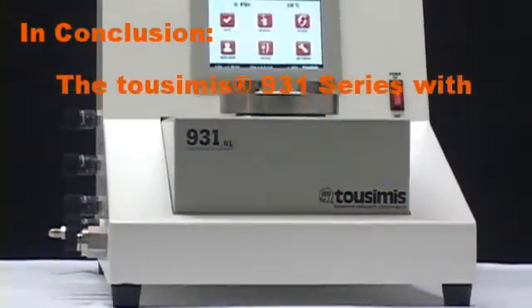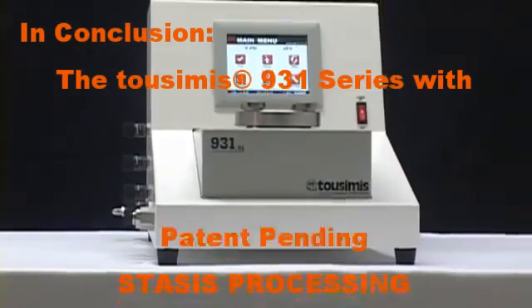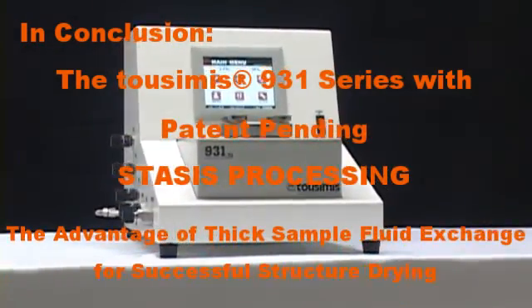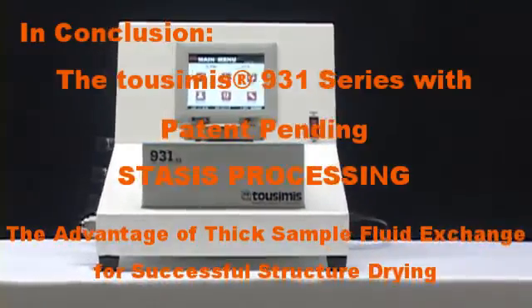In conclusion, the tousimis 931 series, with its standard features and access to the patent-pending stasis processing, gives the user the advantage when taking on thicker, more difficult samples.